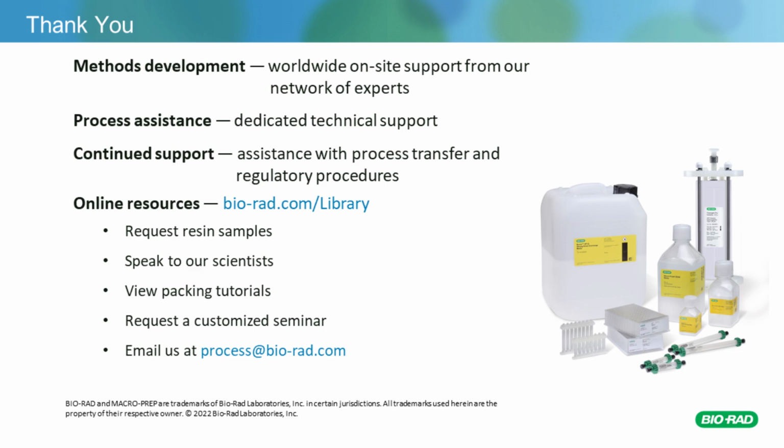The last question for the webcast is, why was ethanol used during insulin purification? Yeah, that's a really good question as well. So ethanol was used to increase the stability and solubility of insulin. Insulin, it's hydrophobic and it's stable in organic solvents. It's also been known to decrease the elution volume and increase yield as per publications in the past.